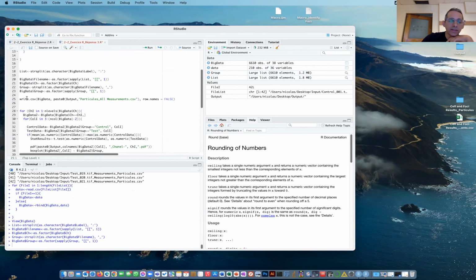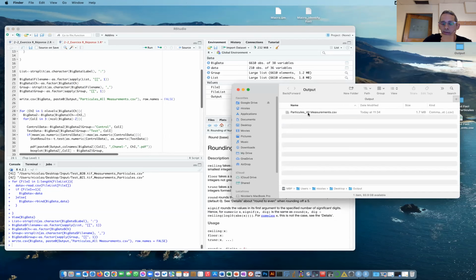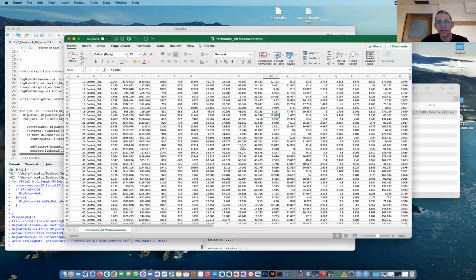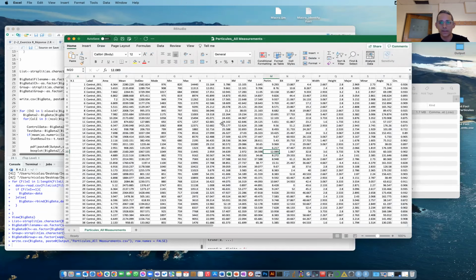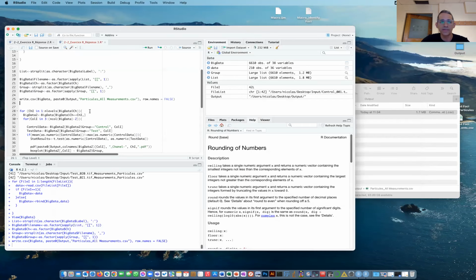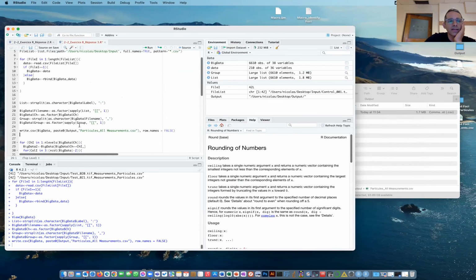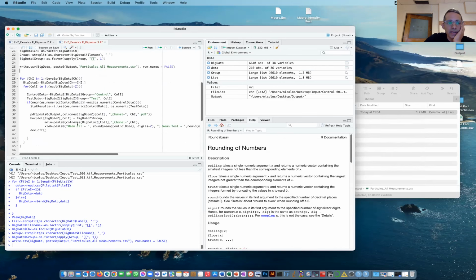You can also save it, and this is a very useful function. So I'm going to save it into my output as a CSV file. So it's there, and you can open it with Excel if you want. Some people prefer Excel for manipulation, but in this case, gathering all the files would have cost me a copy and paste 50 times with possible mistakes. It took me 5 lines, and there is no mistake in that.